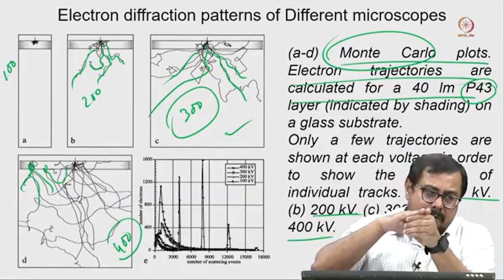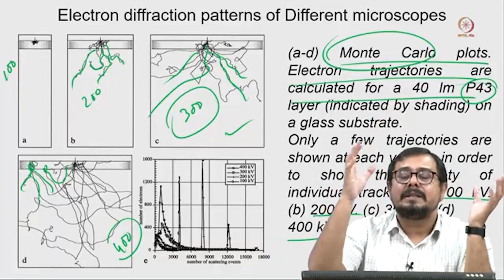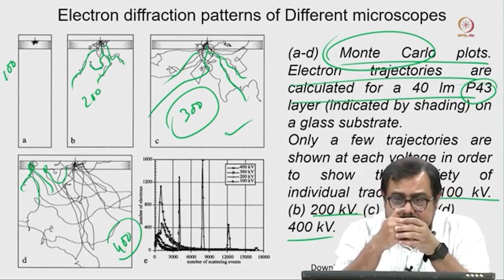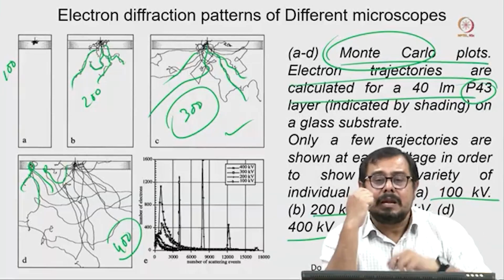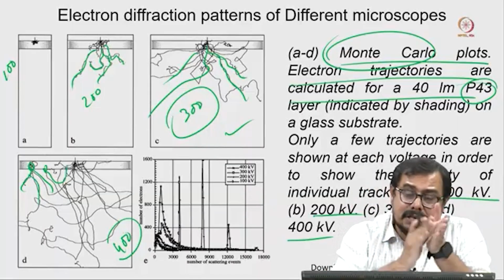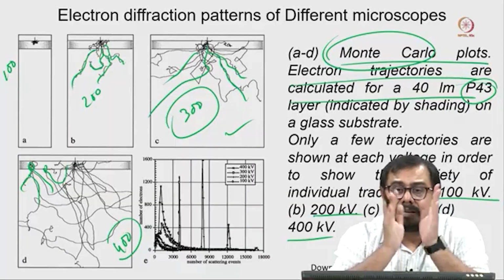When there is amorphous ice and the electron beam is going through that sample, there is a lot of energy, and that will generate a thermal drift. At that point you will be in continuous motion, and if we want a high resolution structure, this drift is going to affect our images. That is the reason we need a very fast readout.